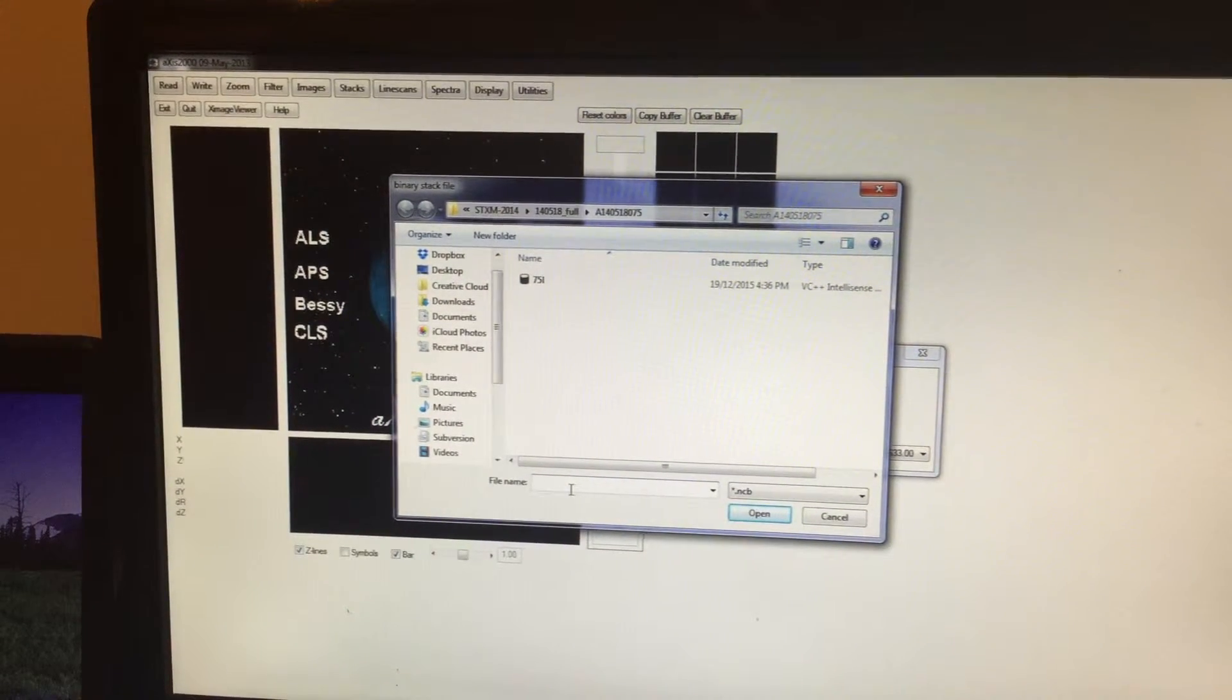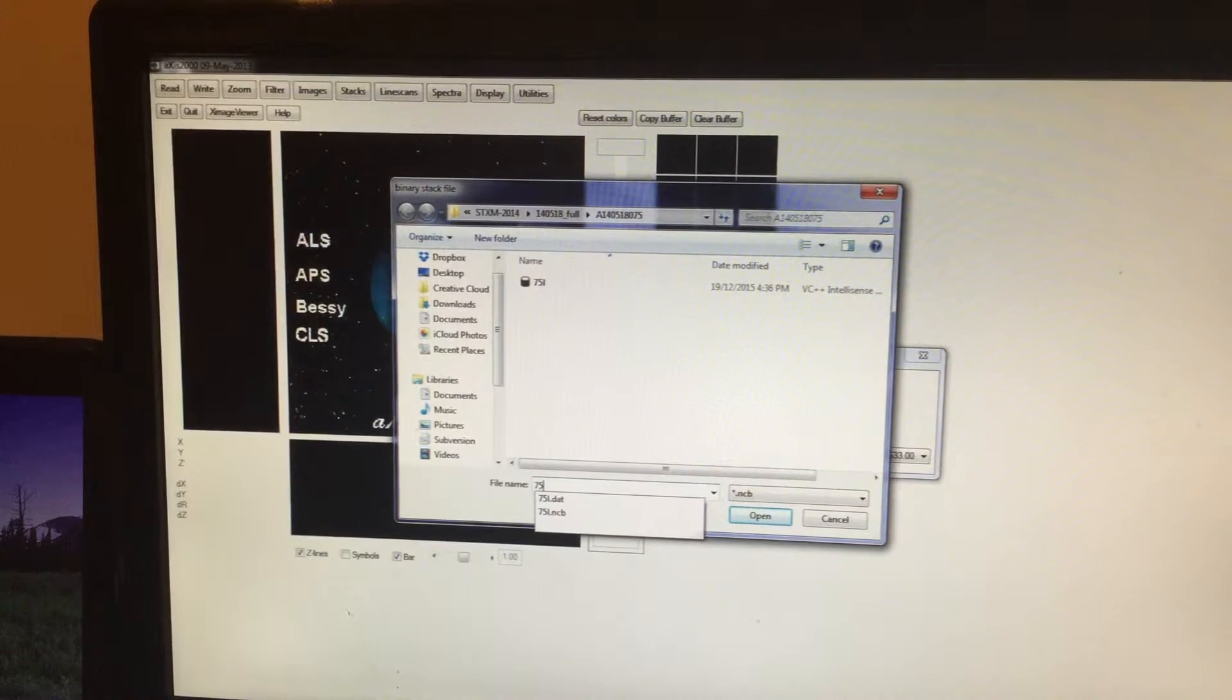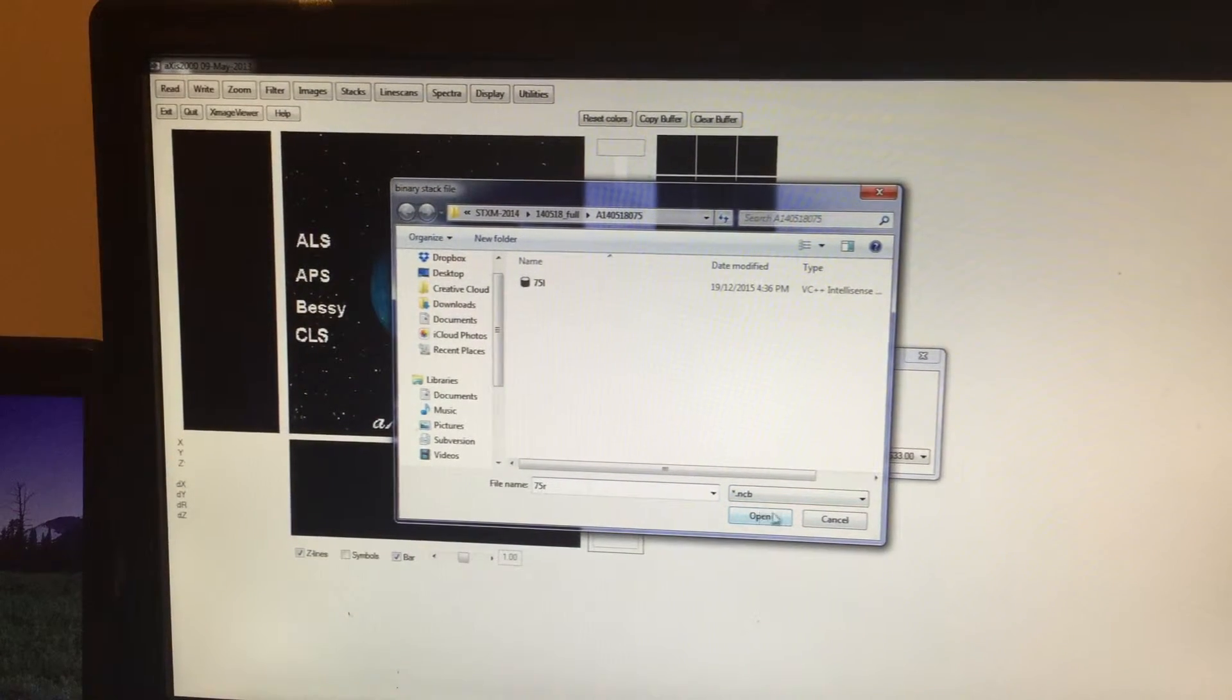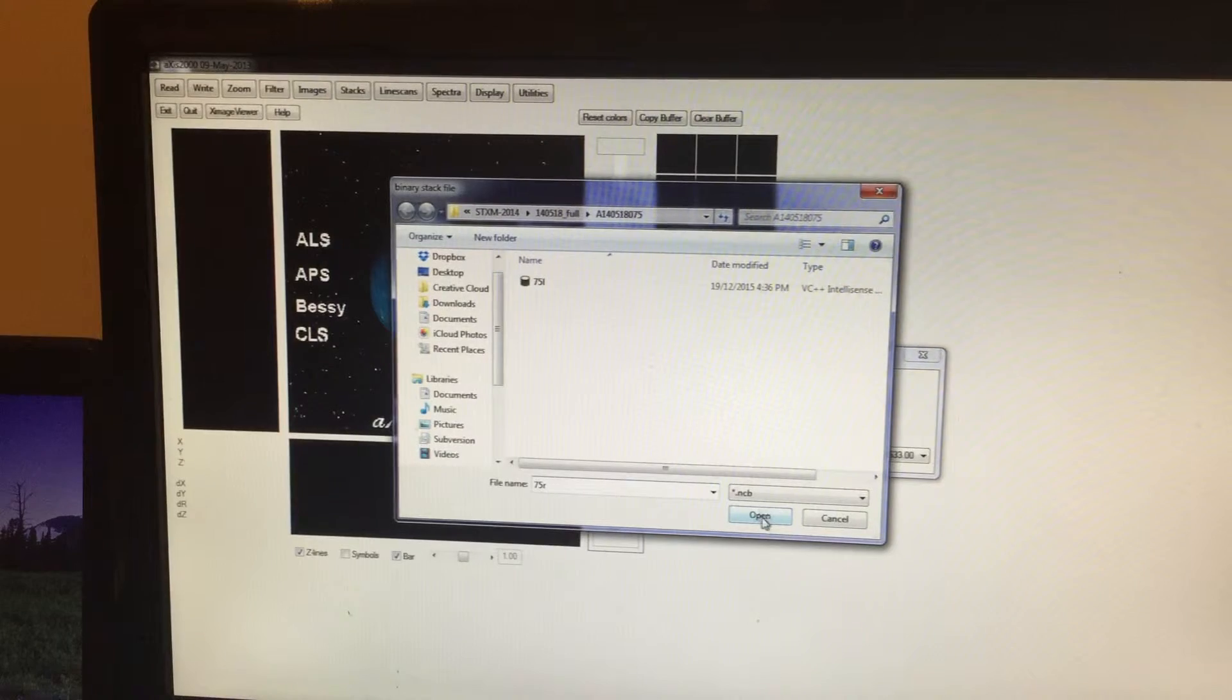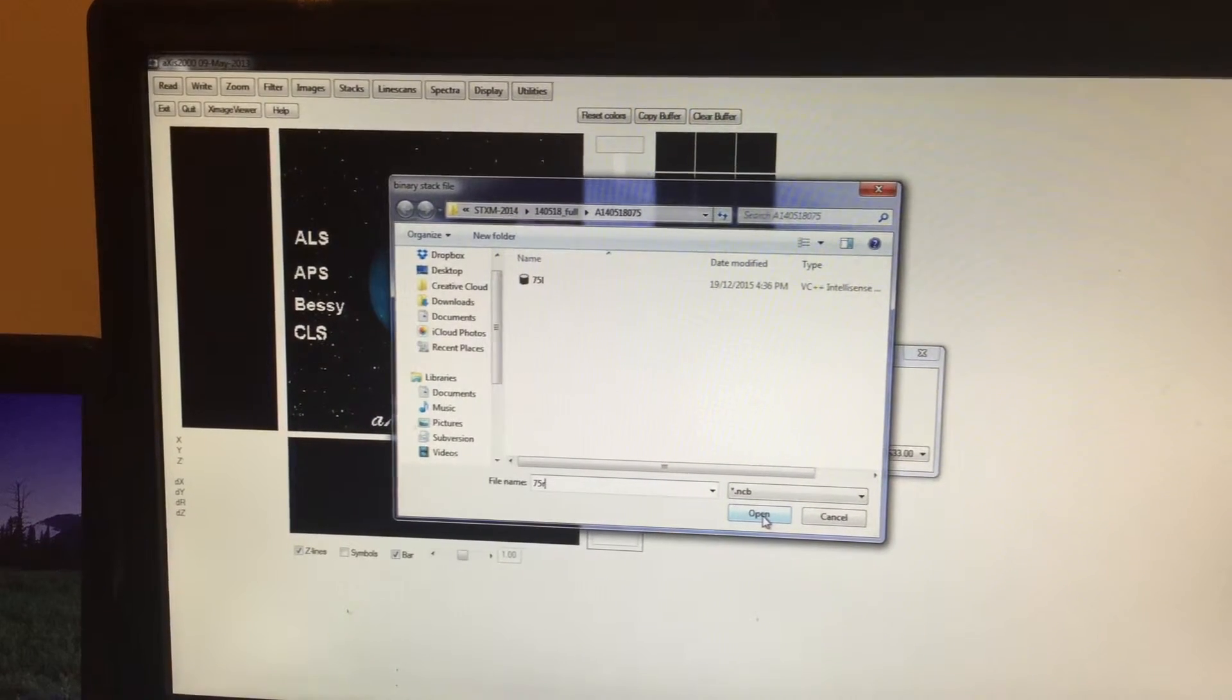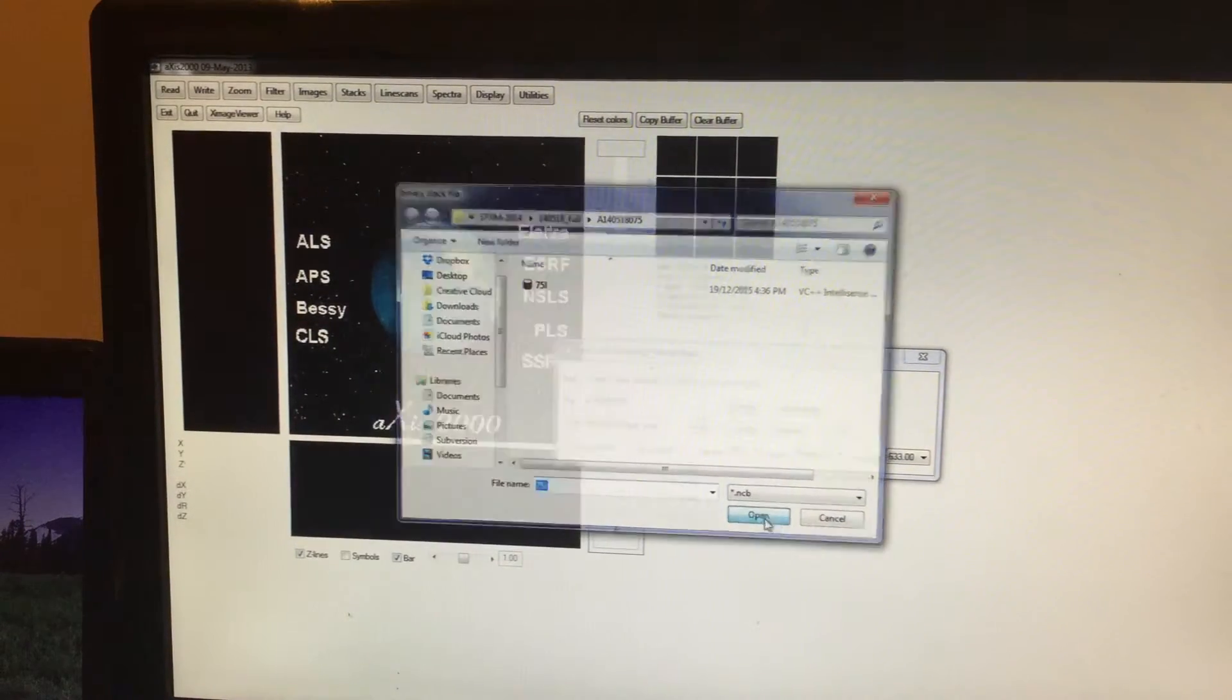I will call this 75R. You can see here Open—don't get confused, which is nothing but Save. You are saving the data, so click on Open.